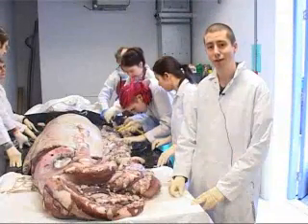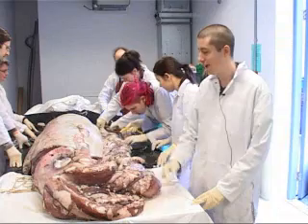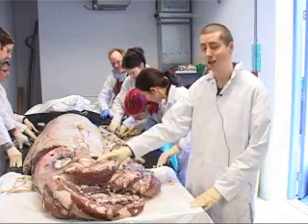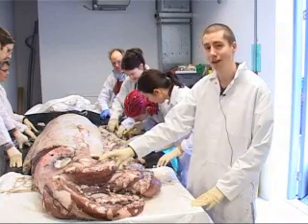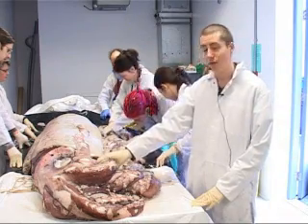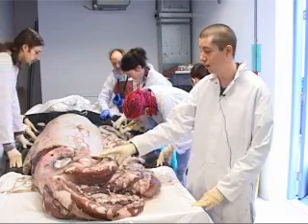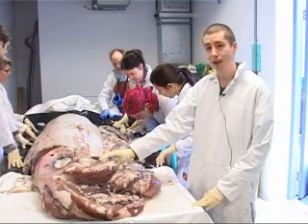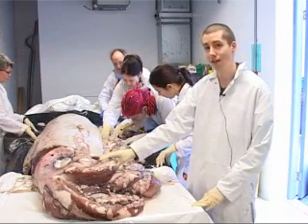It's the 24th of February 2005, and today we're going to start to preserve and fix the giant squid Architeuthis — the specimen that we've recently got from the Falkland Islands. It's quite a rare specimen for us because very few Architeuthis specimens are caught live and are so complete, so we're really excited about adding this to the collections.